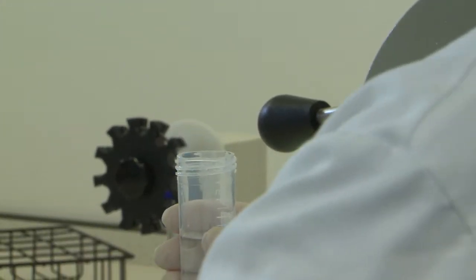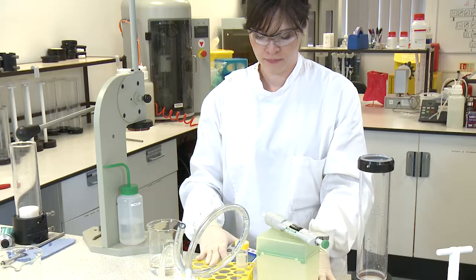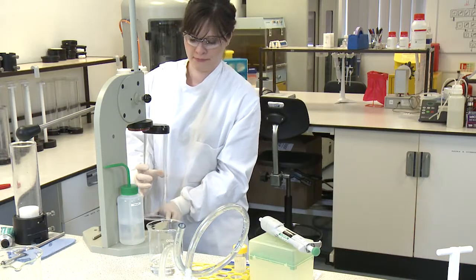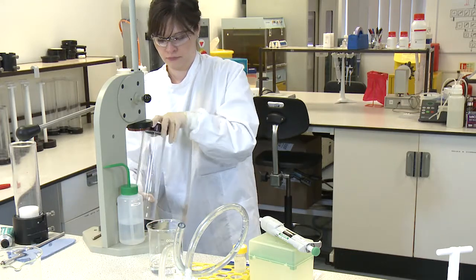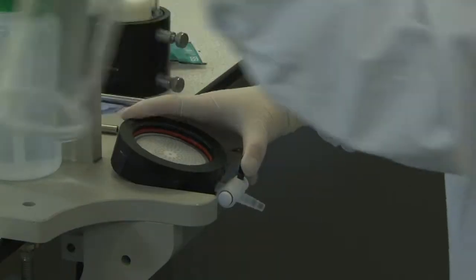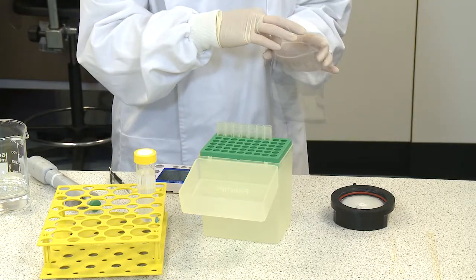Note that for high turbid waters, more than one membrane can be used for the concentration step. They can be placed into the concentration base, smooth side up. Remove the concentrator tube from the base. Use the jaws of the wash station to help do this. Using forceps, carefully remove the membrane and place in a membrane bag.